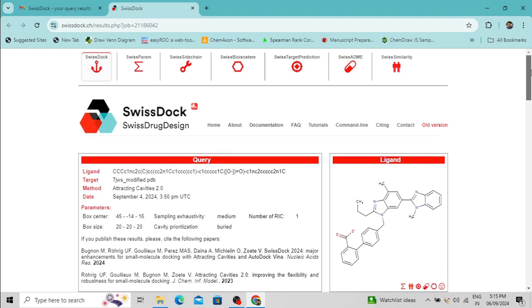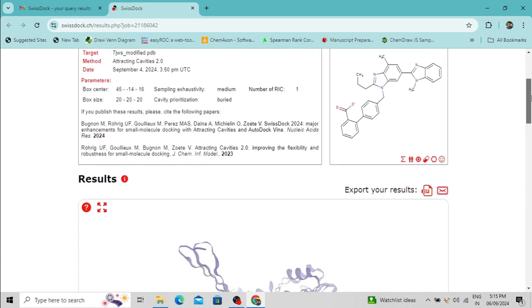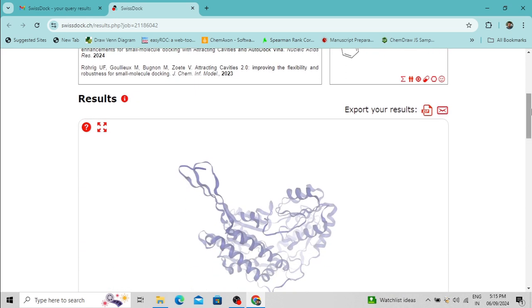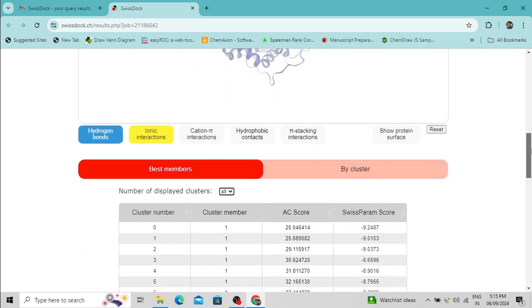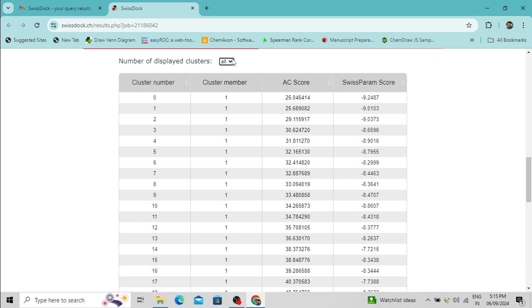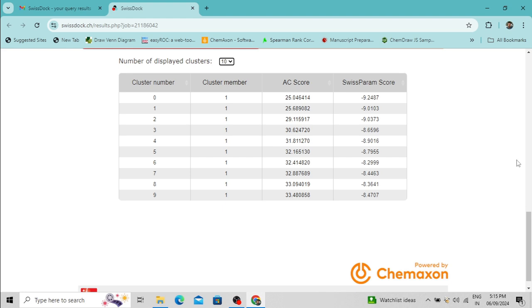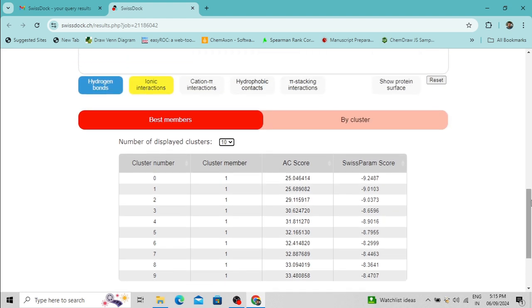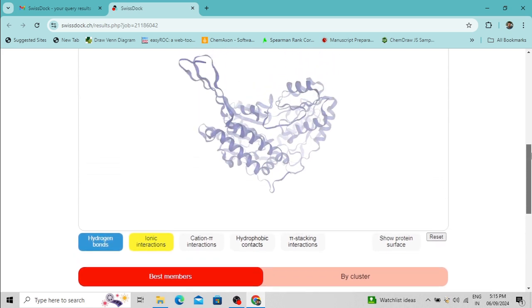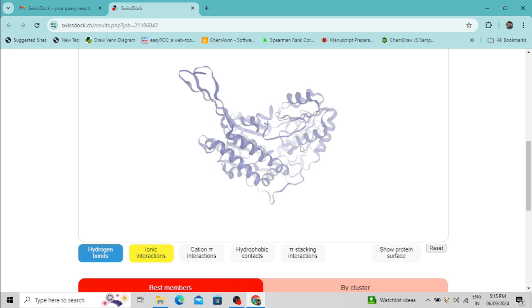The docking is now running. The molecular docking has finished and the result is presented here — I received an email containing the link to the result. These are the cluster numbers. When molecular docking is performed, several docking poses are obtained and these docking poses are clustered based on their similarities. The region enclosed in the grid box is visible here.